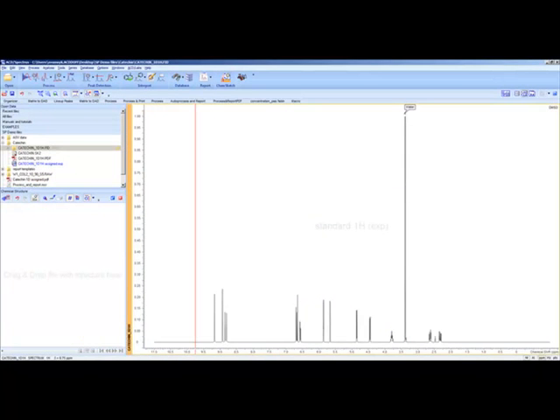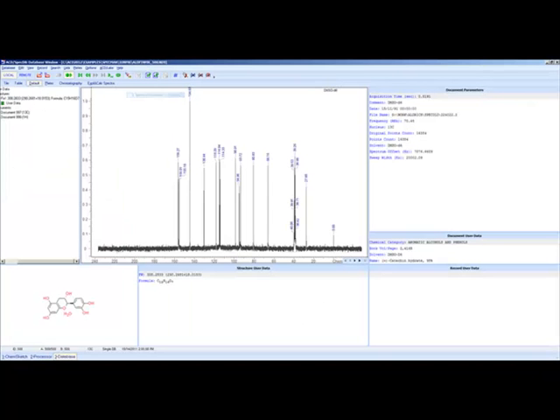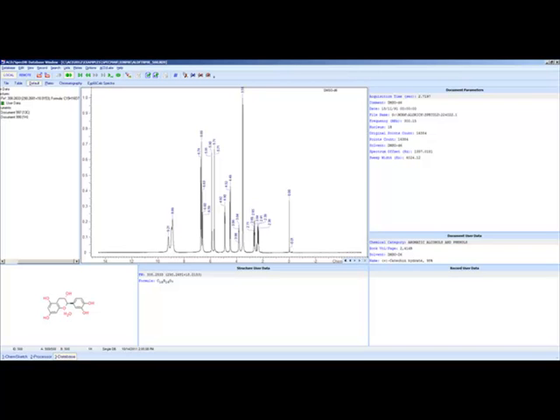At the production stage, the question, have I made what I think I've made, is also valid. Typically, the spectrum of the purified compound will be compared with a reference PDF. However, if an expert user has created an NMR spectrum database, or a commercially produced spectrum database is available, such as the one being shown, Spectrus Processor offers a much more efficient alternative.